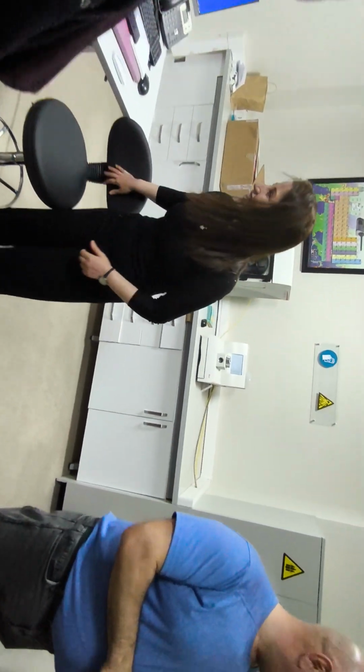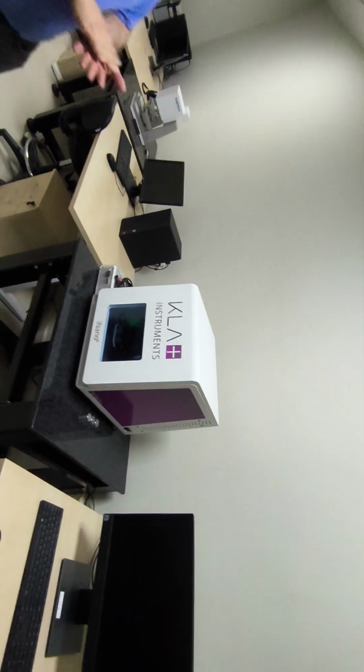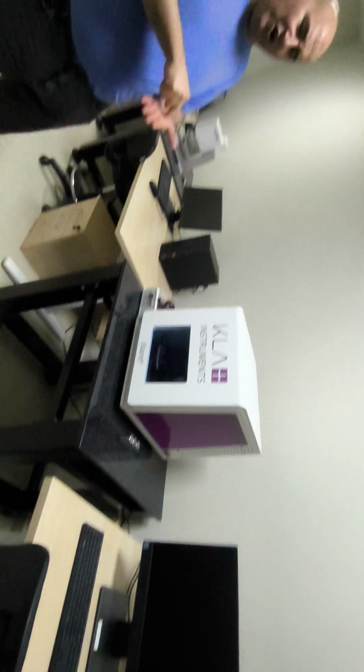I will show you some things here, also for surface. For surface, we have this nanoindentation instrument. If we have one part, we can see the local hardness on the surface.